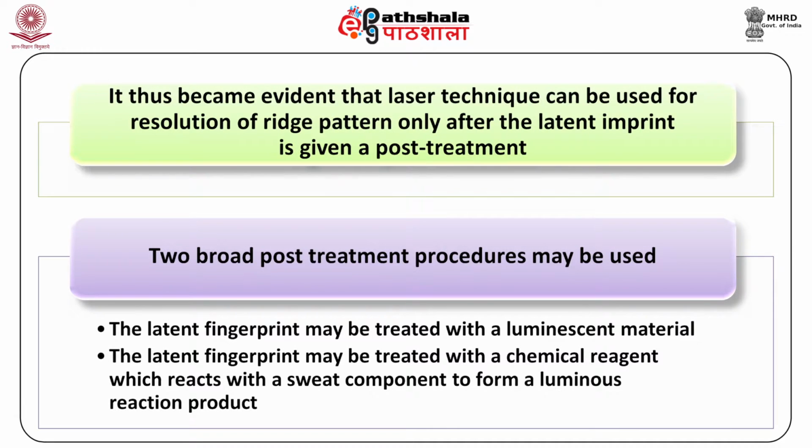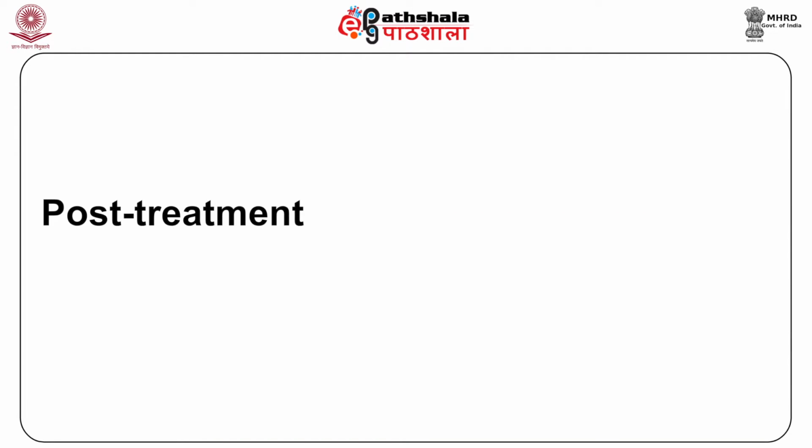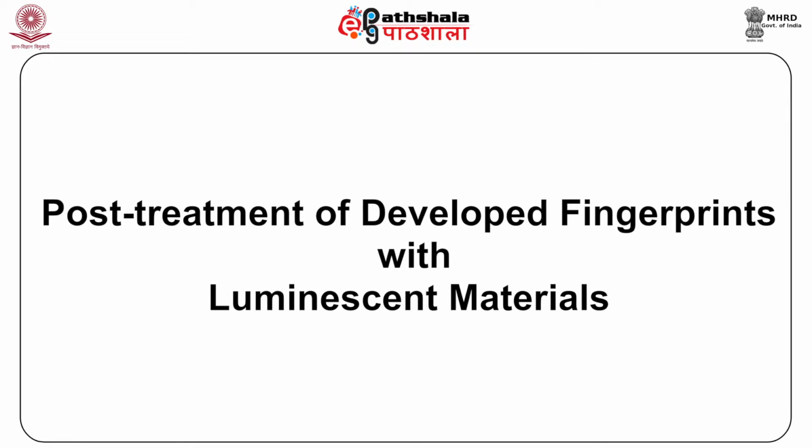utility. It thus became evident that laser technique can be used for resolution of ridge pattern only after the latent imprint is given a post-treatment. Two broad post-treatment procedures may be used. Number 1, the latent fingerprint may be treated with a luminescent material. Number 2, the latent fingerprint may be treated with a chemical reagent which reacts with a sweat component to form a luminous reaction product. Now, let us have a look at post-treatment of developed fingerprints with luminescent materials.